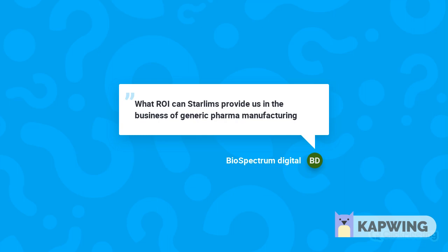So if you're training a LIMS administrator, for example, that's a person that's going to be involved in your project and is going to help you set up your data in the system, that's going to take around 4.5, 5 days. And StarLIMS definitely provides that training for you as part of the project.